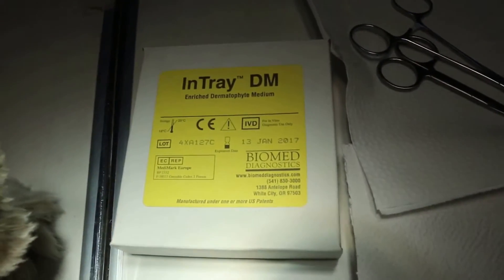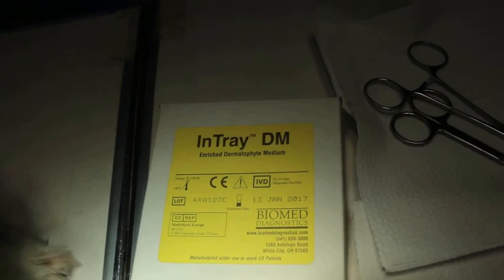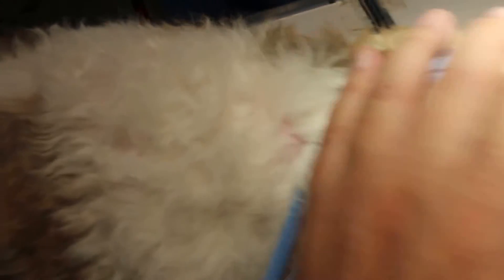Now my assistant will describe how to use the test which is called InTray — InTray Enriched Dermatophyte Medium — to culture the ringworm. She will continue now with the process of how to do it.